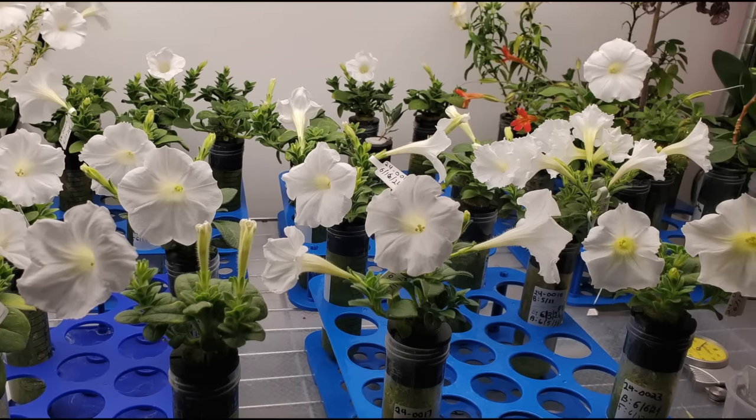You let it dry onto this little sheet of plastic, and the sheet of plastic acts like a shotgun shell. You load it into this cylinder of the gene gun, which looks like an espresso machine. And there's a really short runway of about 2 inches that, under high pressure, that little disc gets accelerated onto this mesh at the very bottom.